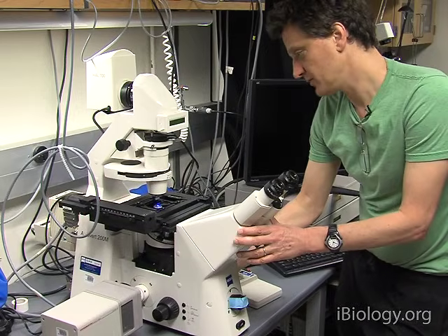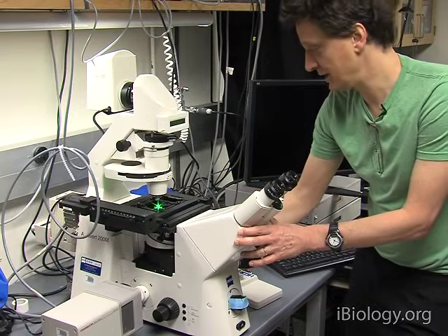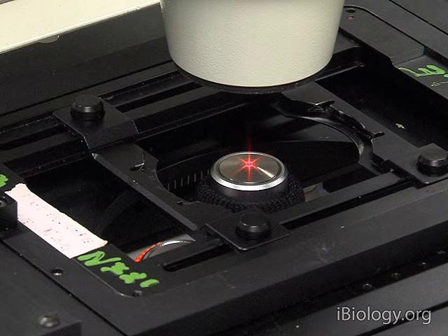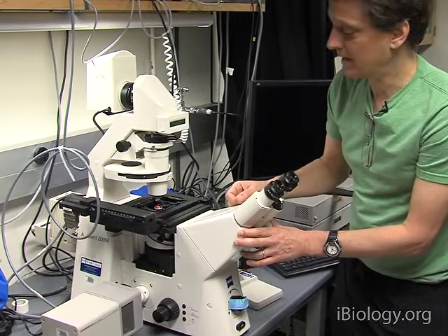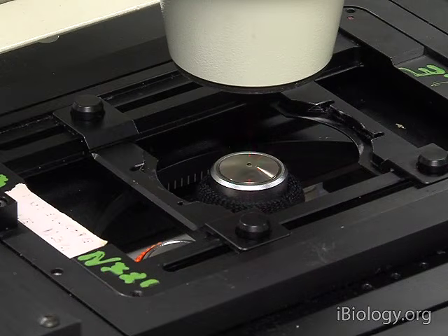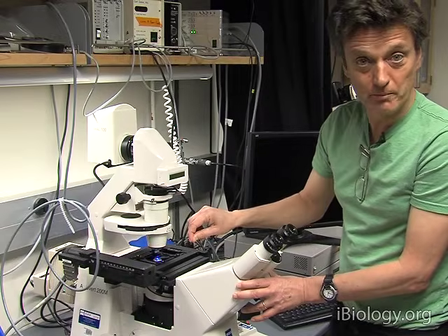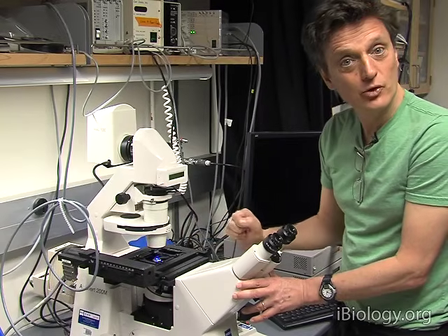Then with a push of the button, I put now another dichroic in place. Here we have green light for rhodamine or mCherry. And if I go on, we get red light for a dye like Cy5. And so just by switching these, we can select the wavelength of the light for excitation and the filter used for emission, and select the fluorophore that we want to image.